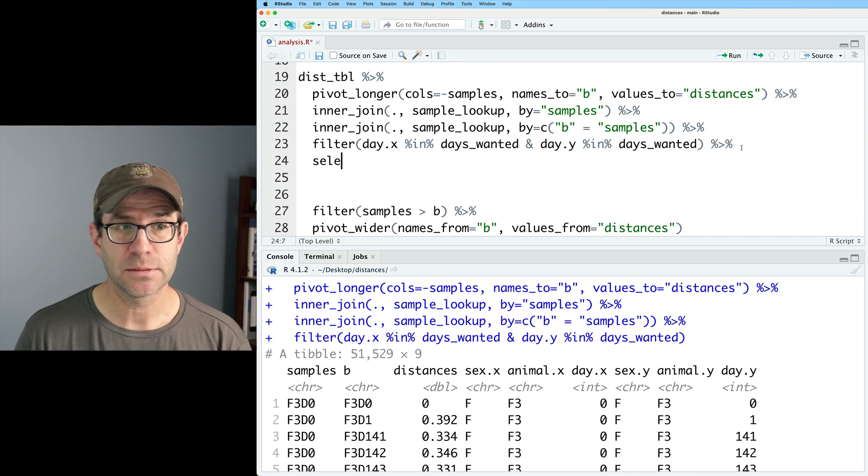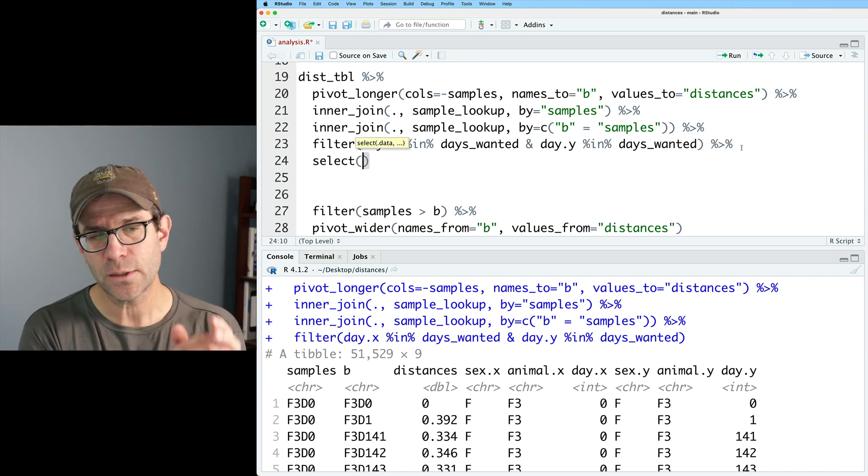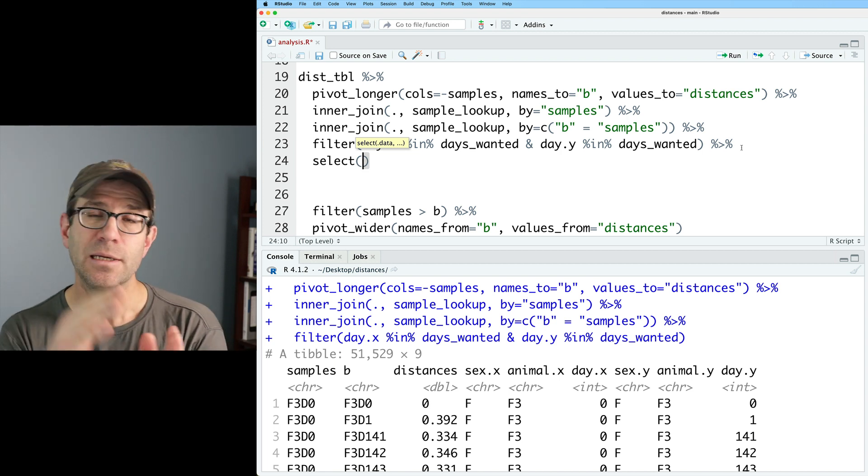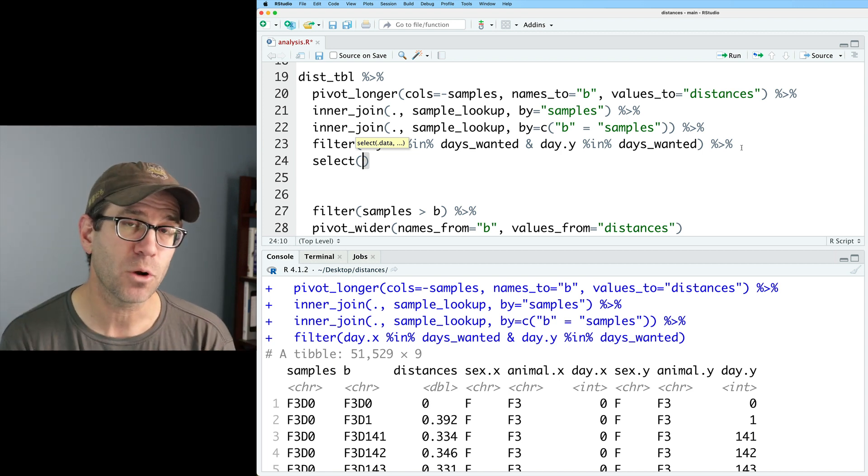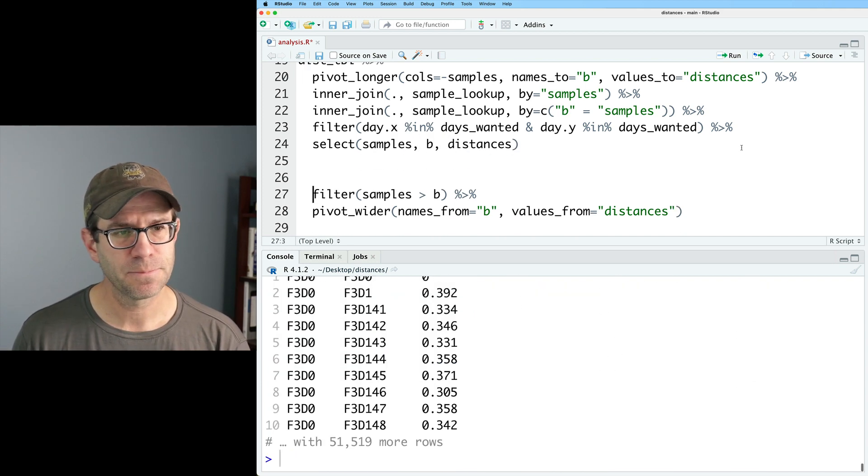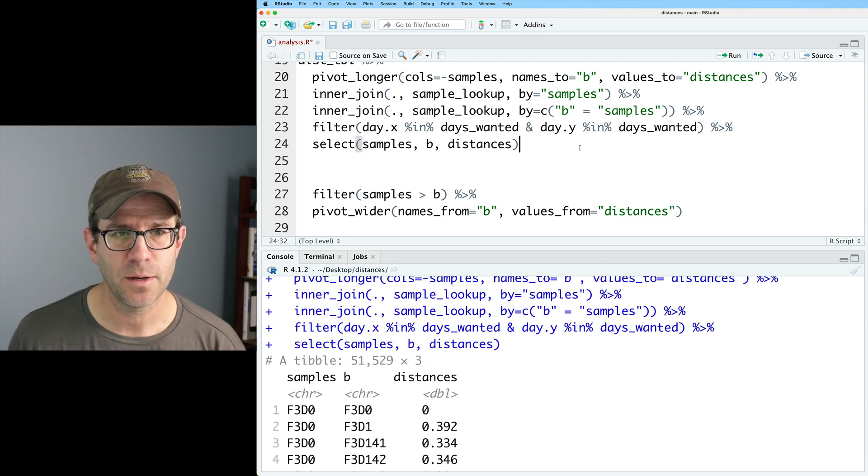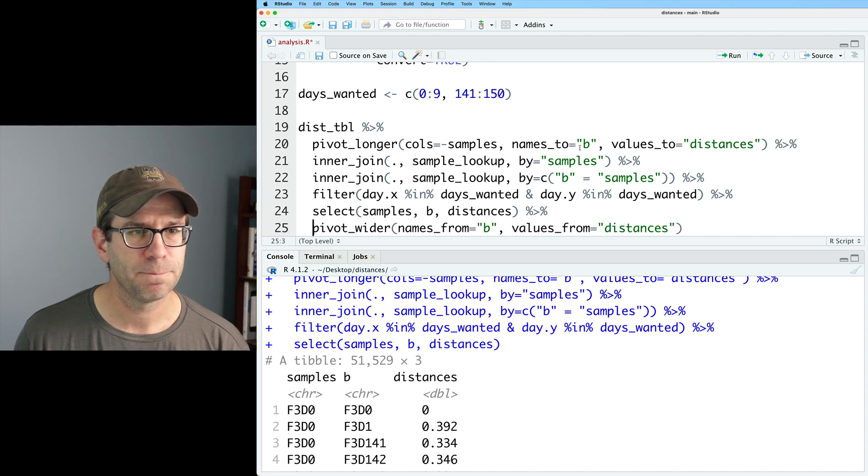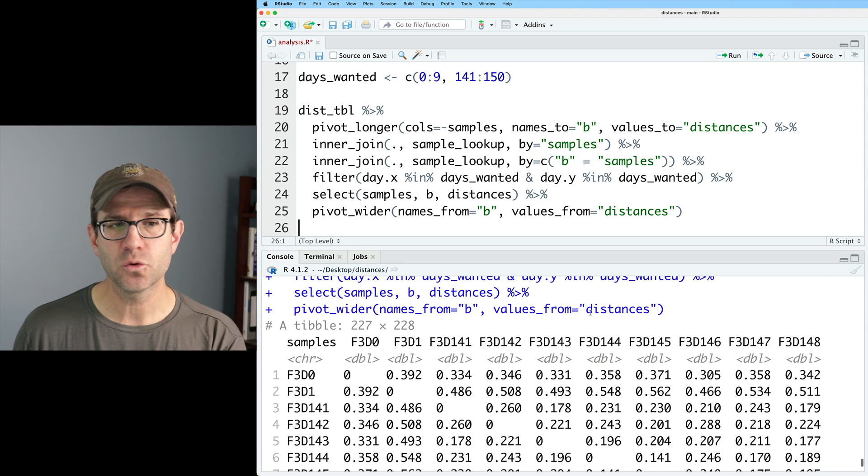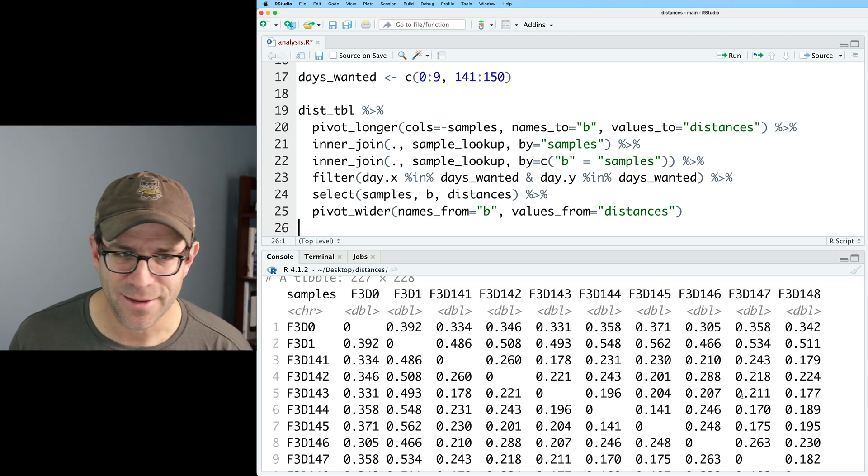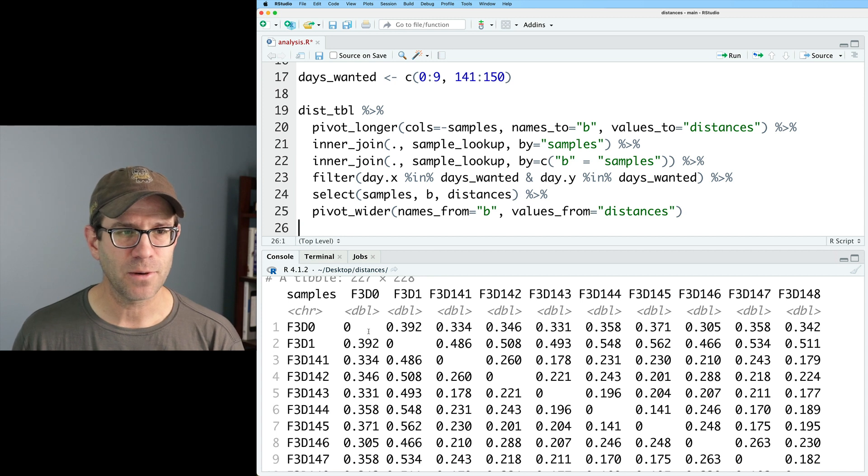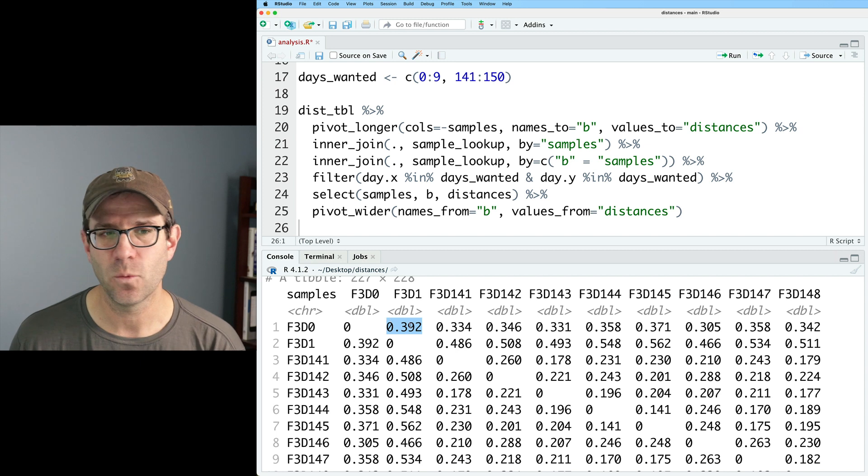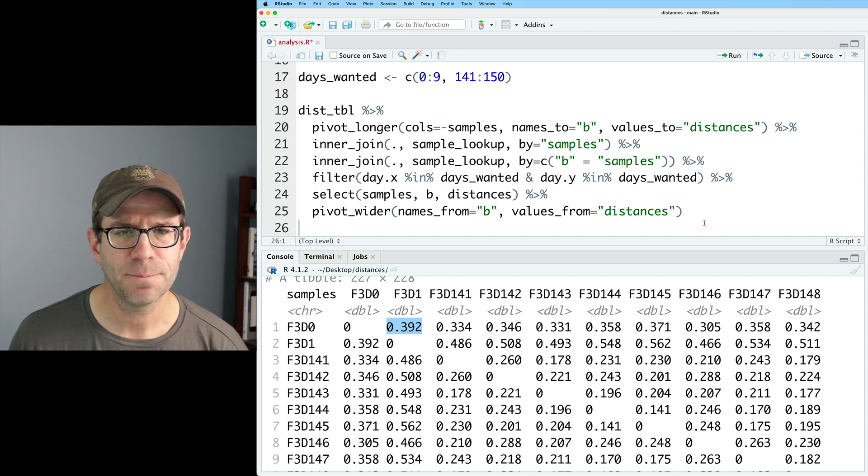So now I can go ahead and do a select because I only need three columns. I only need samples b and distances. I don't need all those .x and .y columns because those were really only brought in to help me to filter my data frame. So I'll do samples b distances. We go down to our three column data frame. And then we can then pipe this into pivot_wider. And so now we have a 227 by 228 data frame. We see that we do have that diagonal of zeros that our data frame is symmetric. So f3d0 f3d1 0.392 is the same as f3d1 f3d0 0.392. So it's a symmetric data frame.